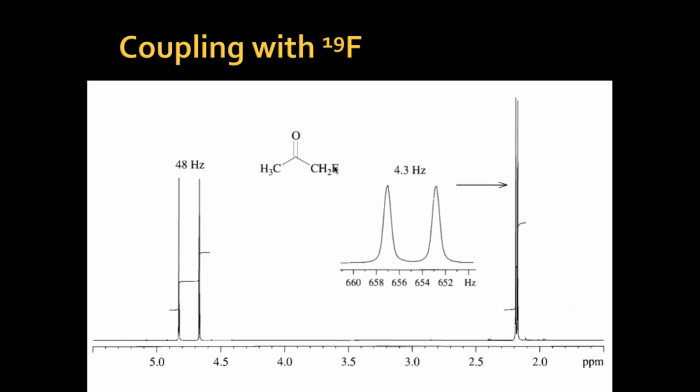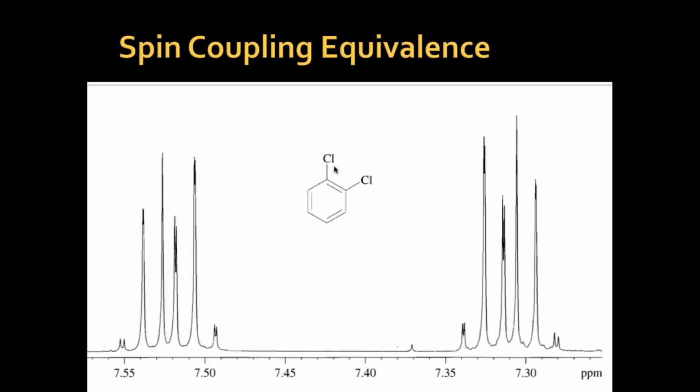And remember, fluorine shows small as well as long range coupling, short and long range. A fluorine spectrum is not easy to interpret. It always gives messy results. If somebody has experience dealing with fluorine spectra, with a big molecule with fluorine attached to an aromatic ring, oh gee, it is very hard to identify each and every proton because it is coupled with every proton. Let's see another example.